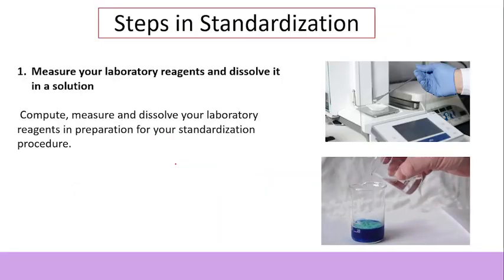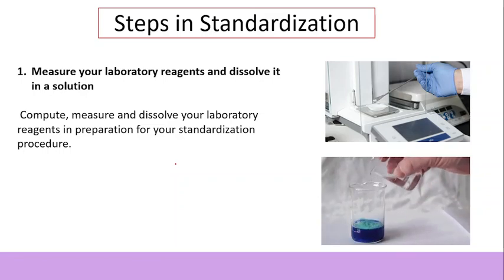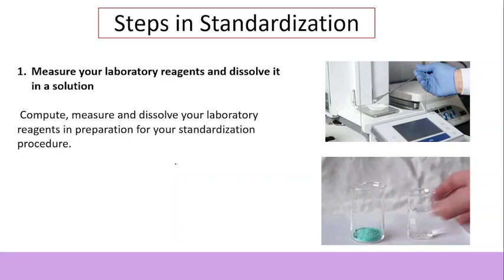Next, ito po, paki-take note ng maigi. You have to take this in mind. Paki-take down notes kasi ito yung mga steps na ma-observe natin sa ating laboratory demonstration. So, we must listen very carefully and dapat maging attentive tayo. Okay? Number 1, measure your laboratory reagents and dissolve it in a solution.